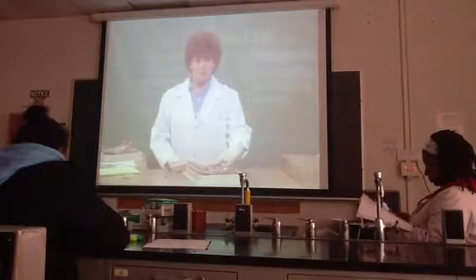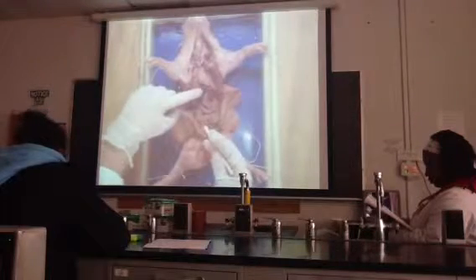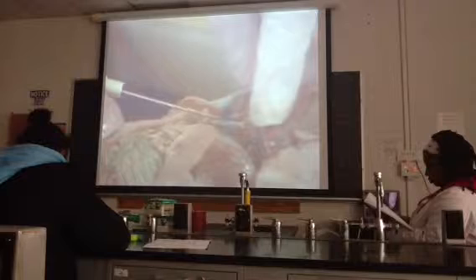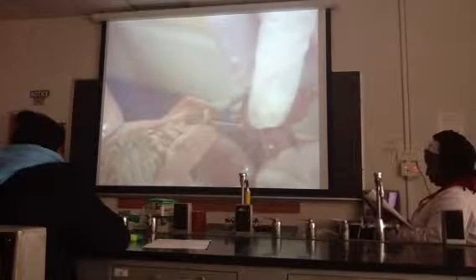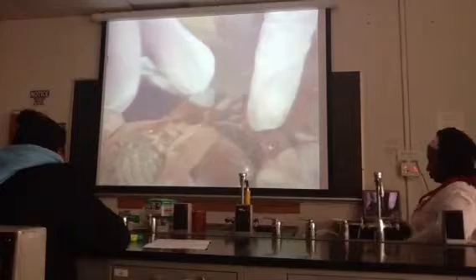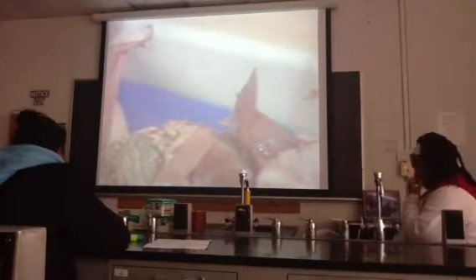We're now ready to begin our study of the internal anatomy. Note this blue structure emerging from the umbilical cord is the umbilical vein. We have tied the umbilical vein in two places with a piece of string. We will now sever the umbilical vein between the two pieces of string, and this way we have freed the umbilical cord.